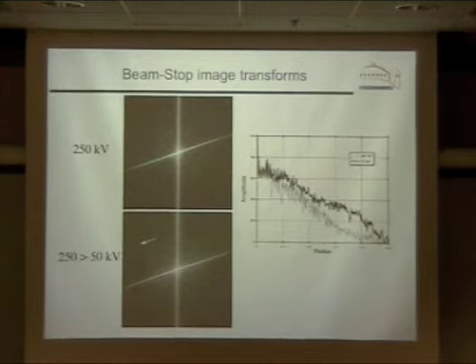At 250, slowed down to 50 kilovolts, so 50 kV at the scintillator. You can see some of this aliasing that Henning talked about showing up. It's essentially the continuation of this line up here that gets folded back over to here. So that represents what looks like a sort of moderate improvement in the resolution. That's an improvement in the modulation transfer function.